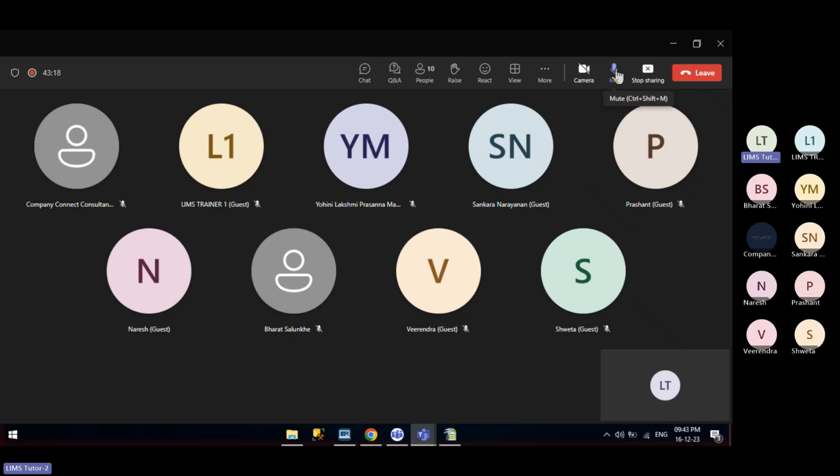The best way to get the results transferred automatically into LabWare LIMS is to just generate the report in PDF form and place it in this folder. That is the only additional work which we found analysts and users are accepting.